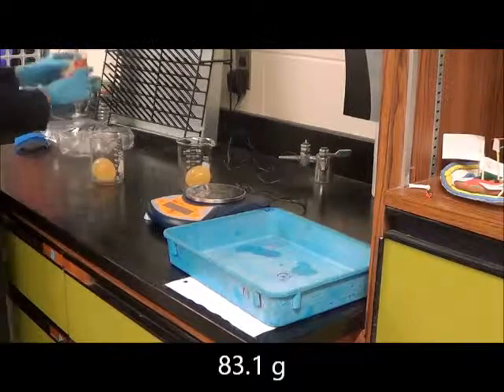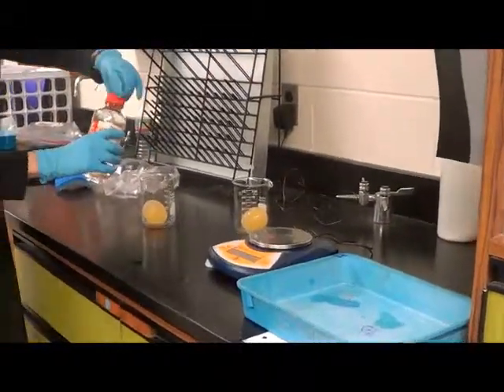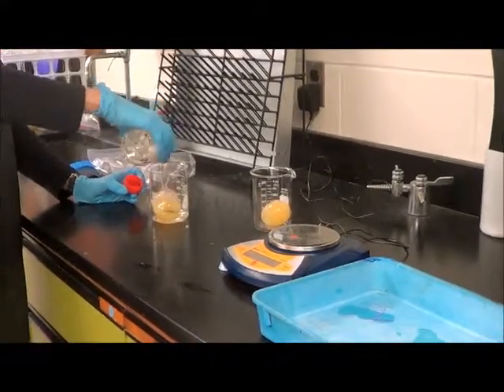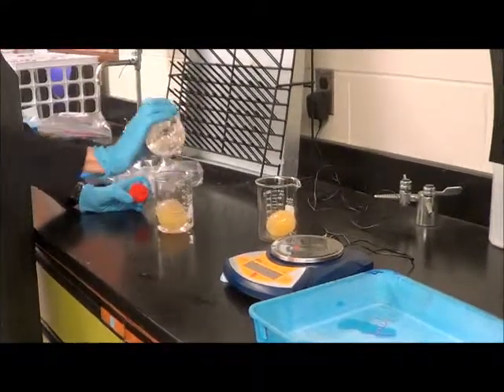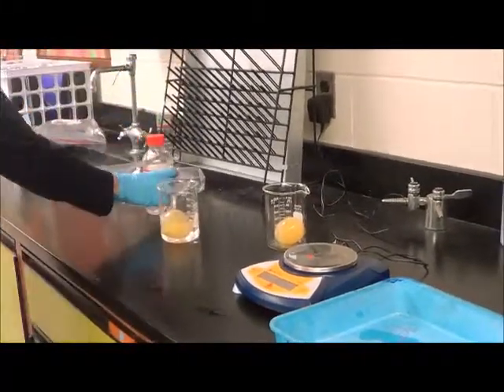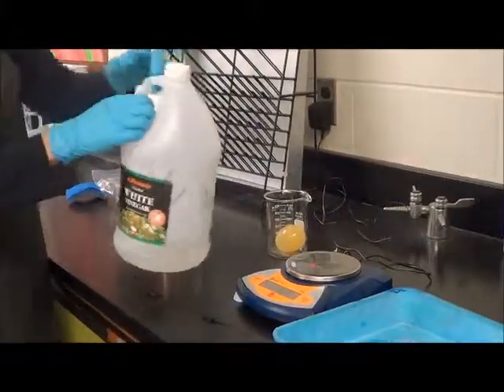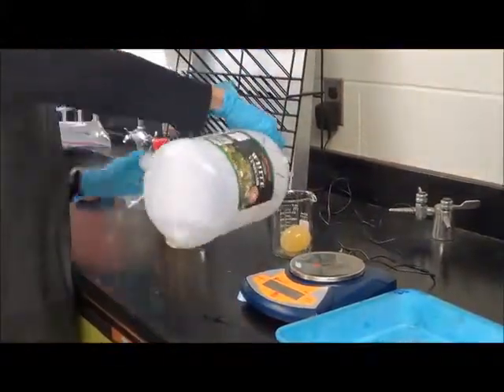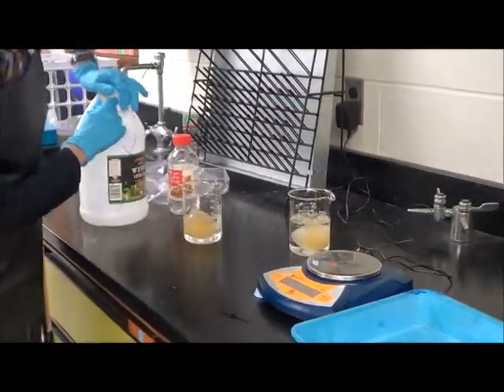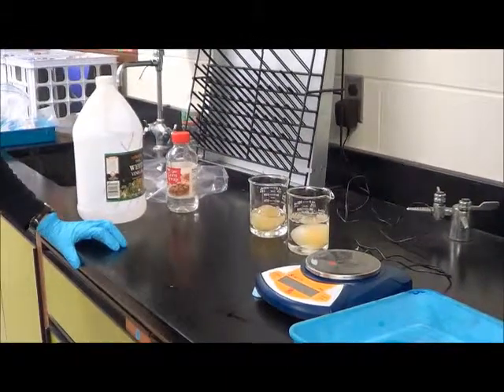For the one that weighed 83, I'm going to put corn syrup in that. Corn syrup is water with a ton of sugar in it. The other one gets distilled water. Then we're going to let them sit for a day, and we'll come back tomorrow and take a look at what happened to them.